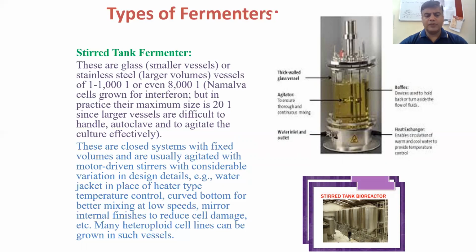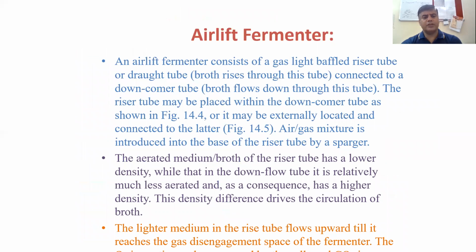These are closed systems with a fixed volume and are usually agitated with motor-driven stirrers, with considerable variation in the design details. Airlift fermenter. An airlift fermenter consists of a gas-lifted baffled riser tube or draught tube connected to a downcomer tube.